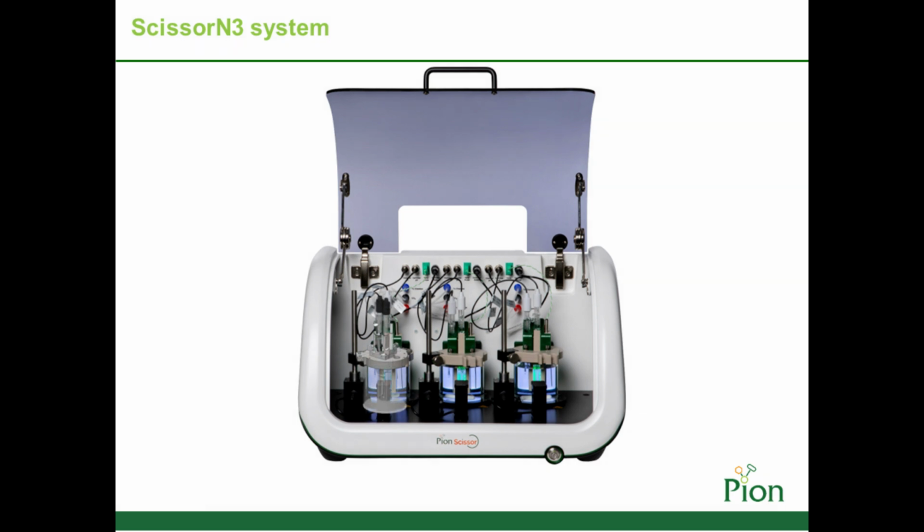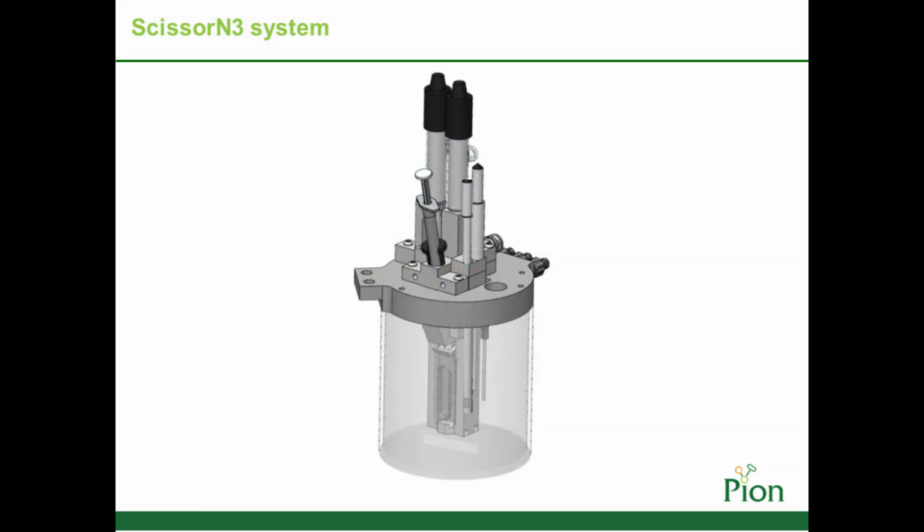So, how does the system work? It works by incorporating a cartridge, which is filled with an artificial extracellular matrix. This is simulating the subcutaneous environment in the system. We inject our pharmaceutical inside the cartridge via a hypodermic needle, and the formulation will then diffuse through that matrix and out via these customized dialysis membranes on the front and the back of the cartridge, out into the chamber environment, which is containing a bicarbonate-based buffer simulating the interstitial fluid.